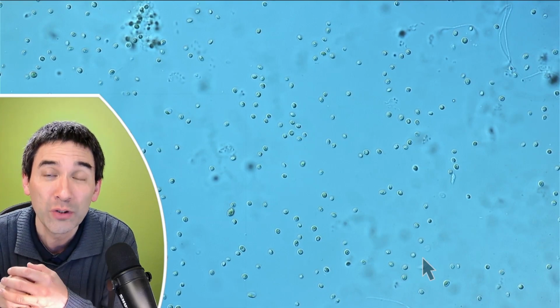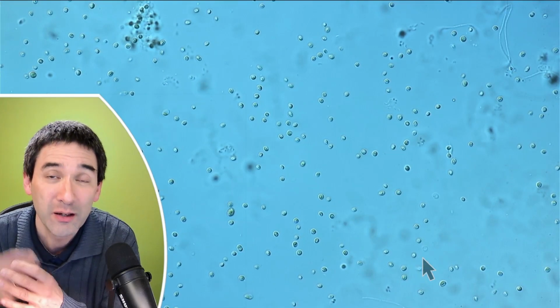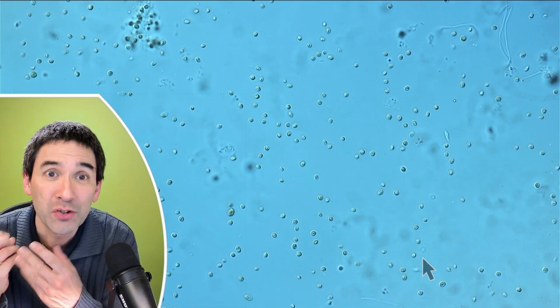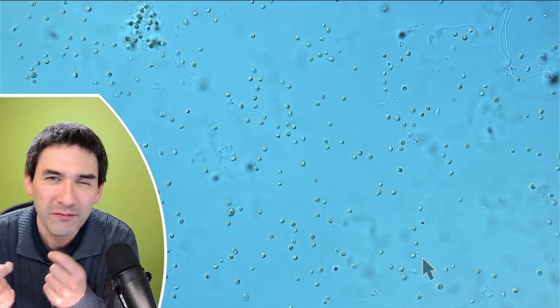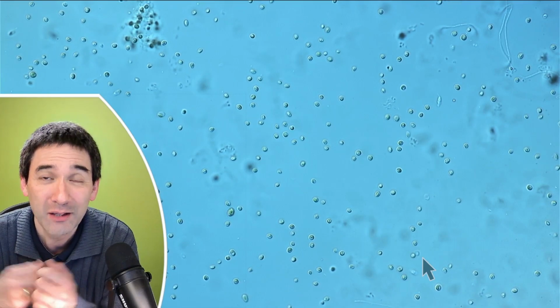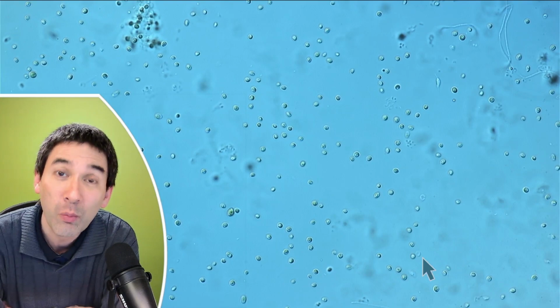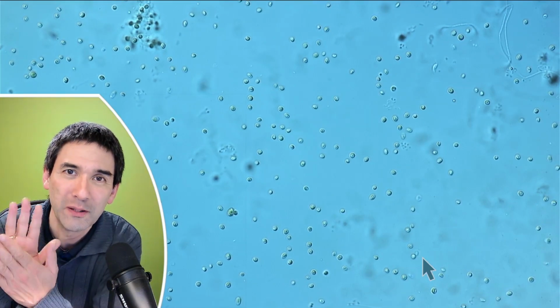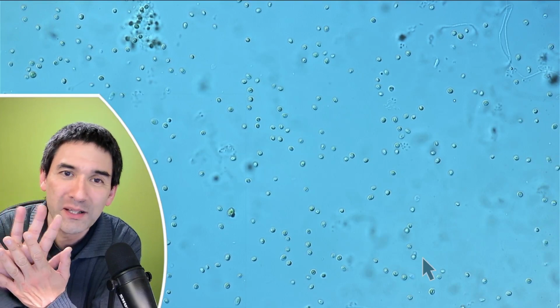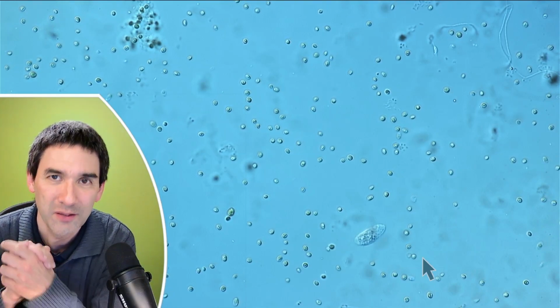And what I'm going to show you now is highly diluted milk. Just regular milk, so a few drops of milk in water, because milk contains a lot of fat droplets, and those fat droplets are very, very small, and therefore they also move much more. And I would like to show that to you. Why diluted? Because if you just take concentrated milk, then there are so many fat droplets that essentially the movement is inhibited. But if you dilute it down, it's going to be much more visible. I'm going to show you.